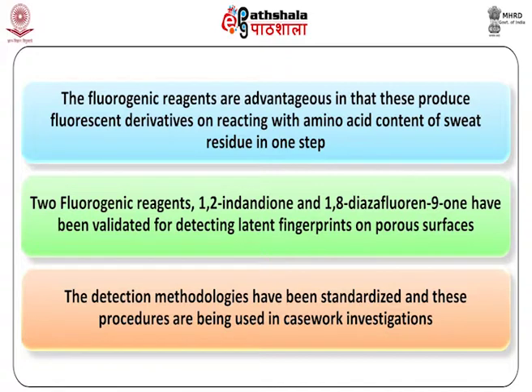And then lastly, we have learned that two fluorogenic reagents, that is 1,2-indandione and 1,8-diazafluorene-9-one, have been validated for detecting latent fingerprints on porous surfaces. The detection methodologies have been standardized, and these procedures are being used in casework investigations.